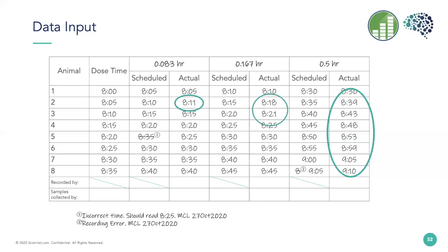And this doesn't necessarily mean we need to get a study director, as the animal's probably low dose, but maybe the dog has a sensitive tummy. And the time we spend dealing with this delayed the next collection as well. But then when you get to the half hour, we have to collect urine. And if there's been emesis, the urine's probably contaminated, and now we have a huge issue that's also delaying the next collections. So this threw off basically the entire schedule.